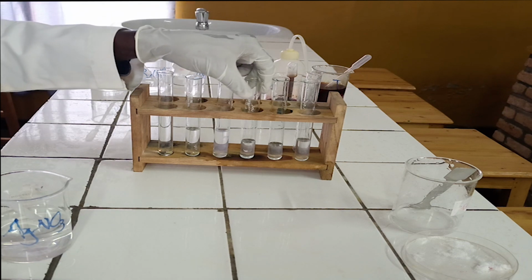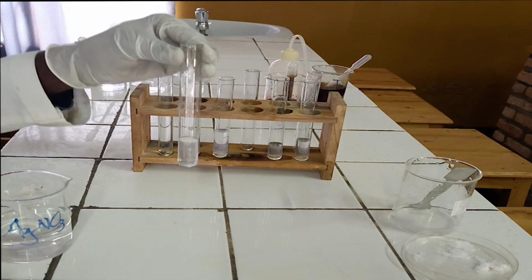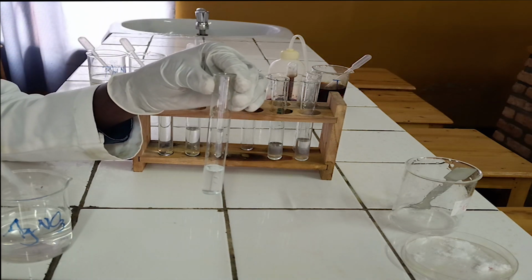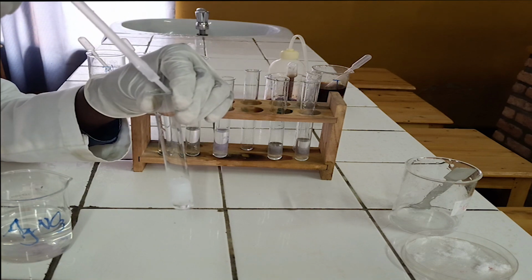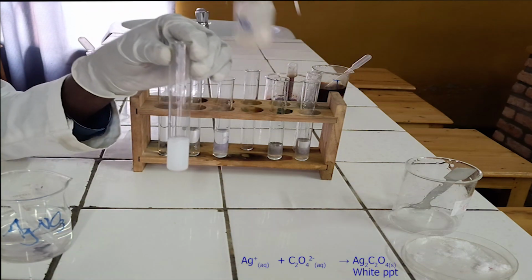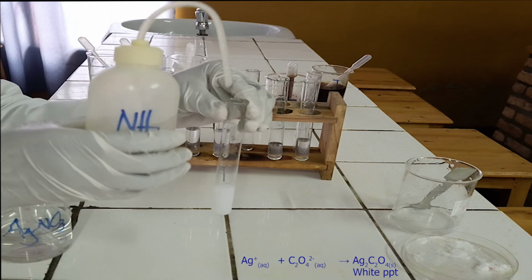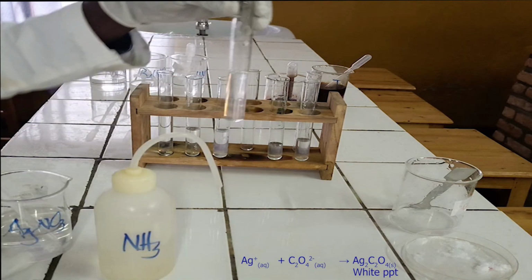To the fourth test tube, add silver nitrate solution followed by excess of diluted ammonia. As you see, silver nitrate solution reacts with oxalate ion to form white precipitate. The precipitate formed is soluble in excess of diluted ammonia.